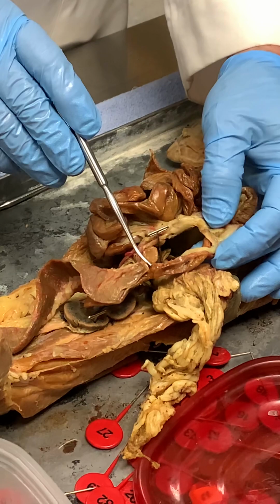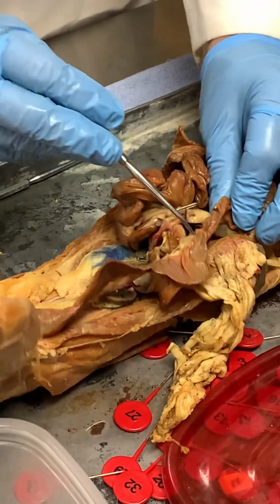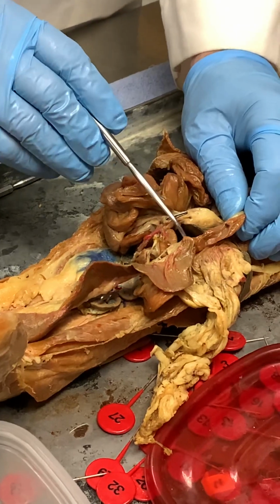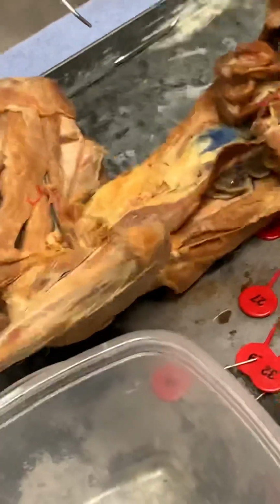Now, if I wanted you to identify the ileal part of the small intestine, I would make sure you could see the large intestine. See how much flatter and bigger the large intestine is. So this would be the cecum. This is, what would this be? The ileocecal. And then this ileum. And then the rectum is way down here.